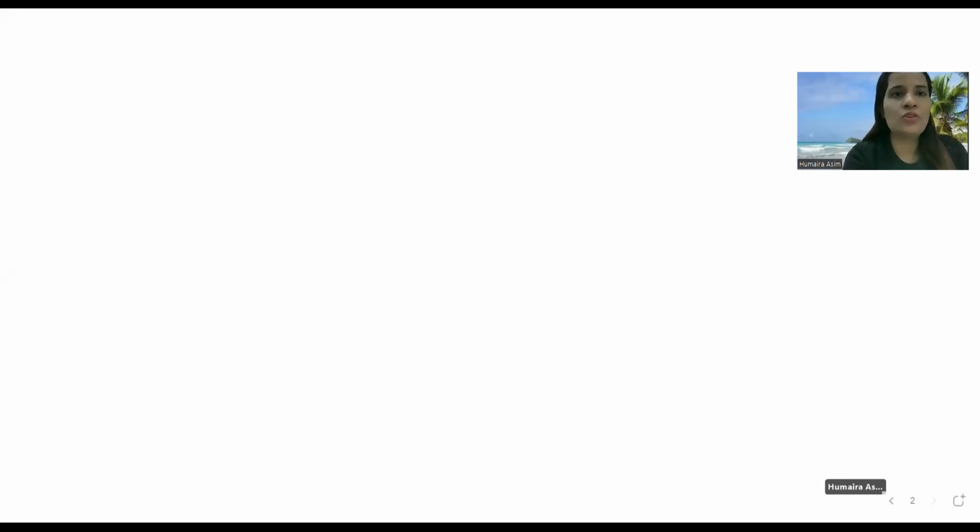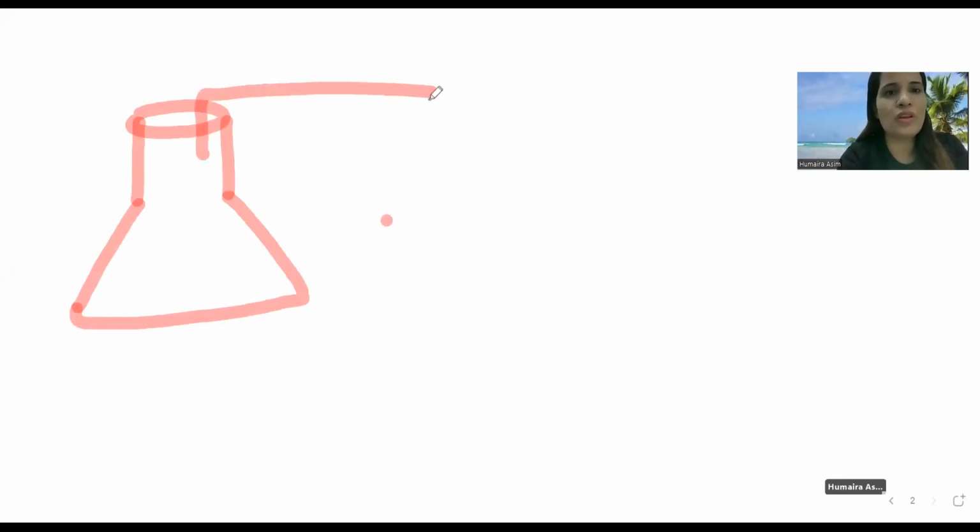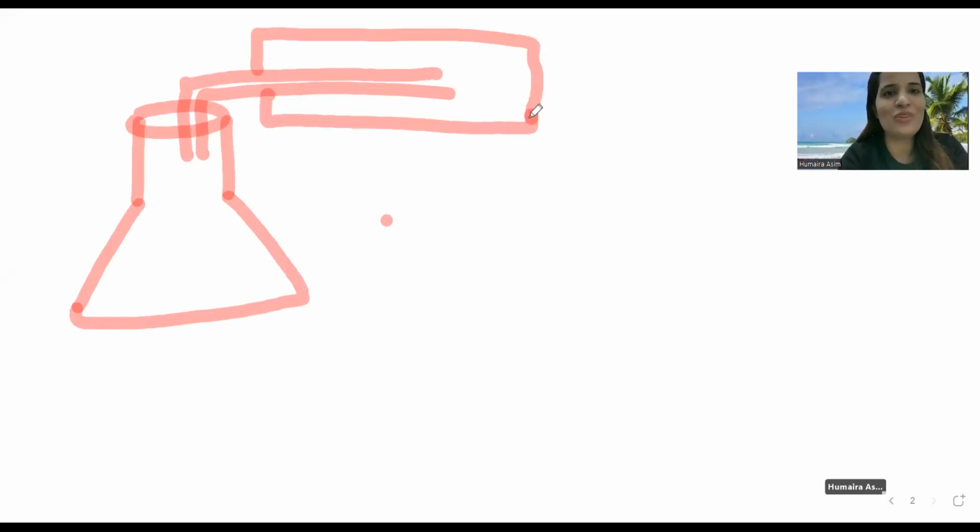Okay, just now I was telling you about the gas syringe, which is not here. So you see here, this is the conical flask, right? Just now I have drawn it for you. So now here, what will we have? This is the delivery tube. Along the way, we are learning all the apparatus. Yeah, this is important. So here, what do we have?